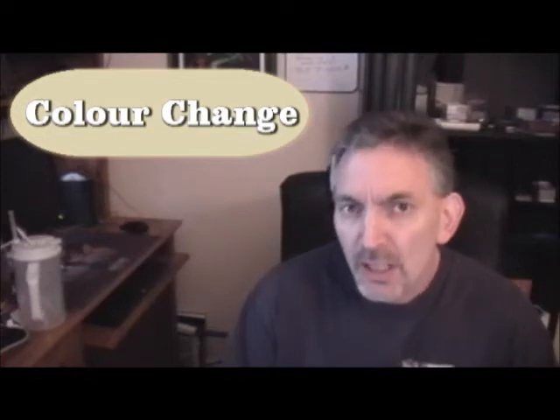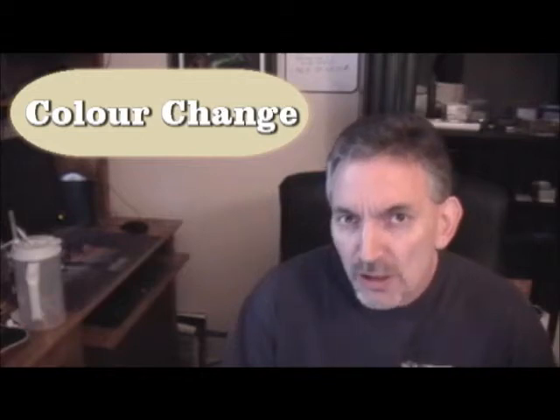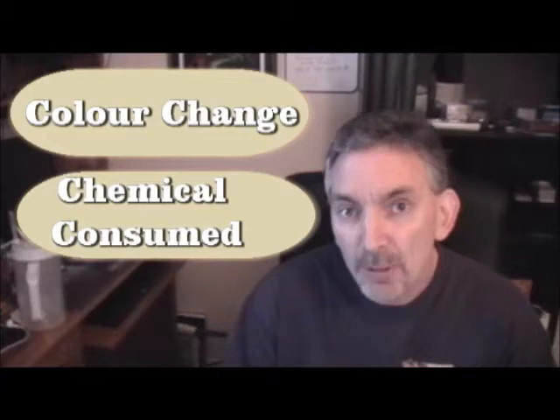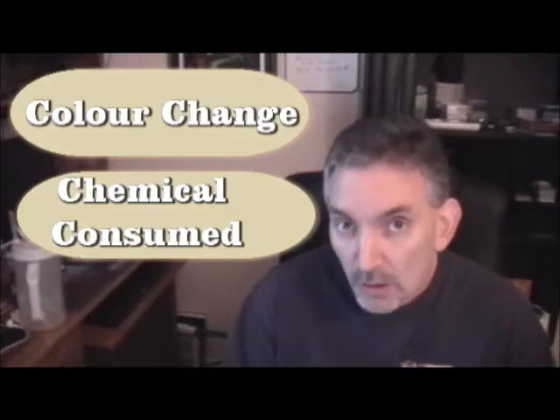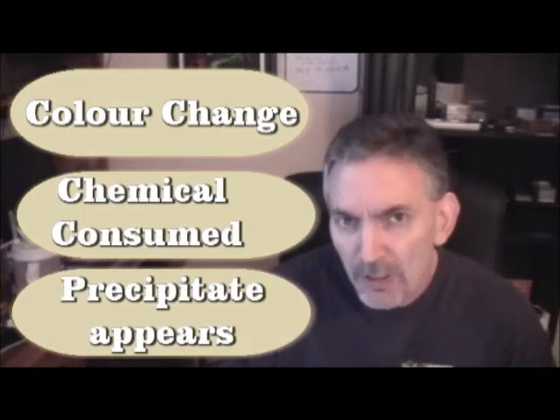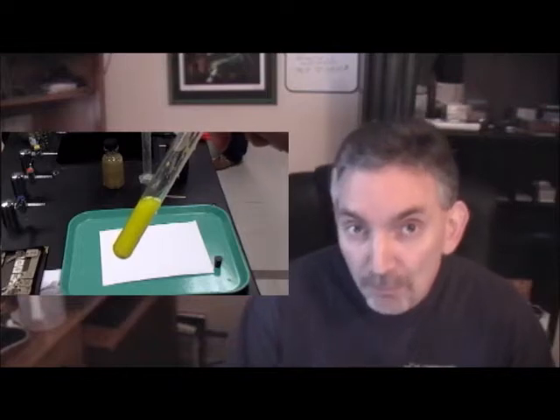There could be the sudden disappearance of a solid chemical in solution, which is a sign of it being used up. Or there could be the sudden appearance of a chemical, which we sometimes refer to as a precipitate. If you can't see through the solution, if your solution looks cloudy, then it's probably a solid precipitate which is blocking the light and preventing you from seeing through the solution.